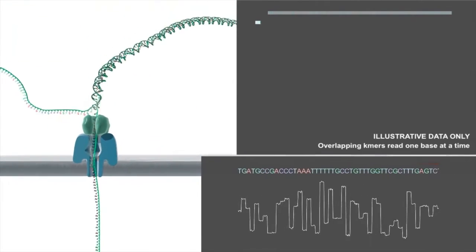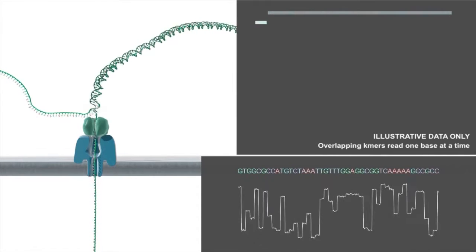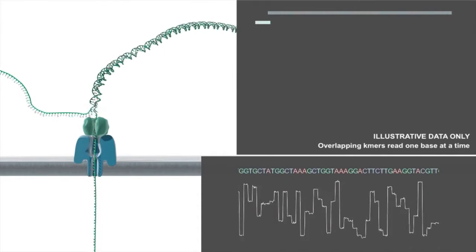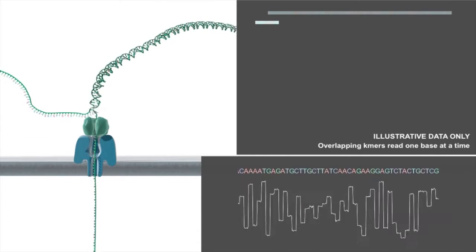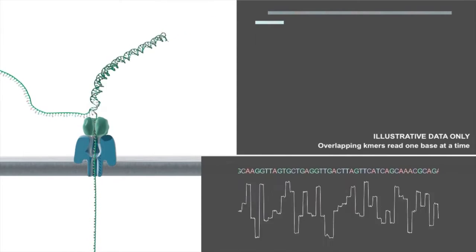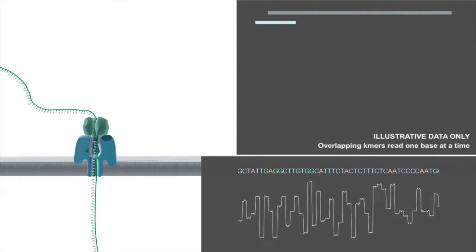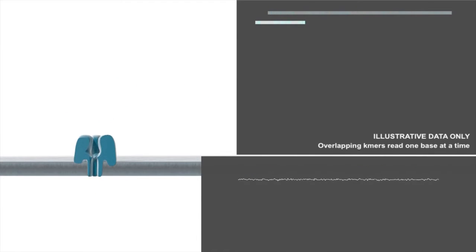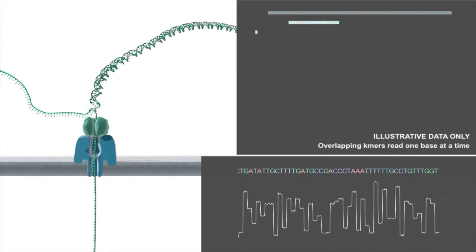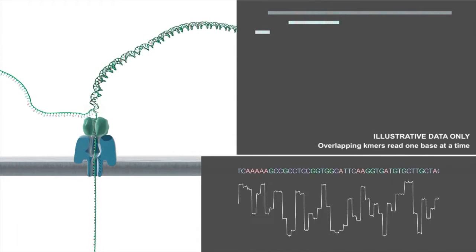The strand sequencing method sequences an intact strand of DNA as it passes through the nanopore. Nanopores have processed read lengths of hundreds of kilobases, and when a nanopore has processed a complete read, it will start a new one. There is no deterioration of accuracy as the DNA strand is sequenced. By preparing the DNA so that it has a hairpin structure at the opposite end, the system can read both strands of the double-stranded DNA in one continuous read. This gives advantages in data analysis and improves the accuracy of the sequence produced.